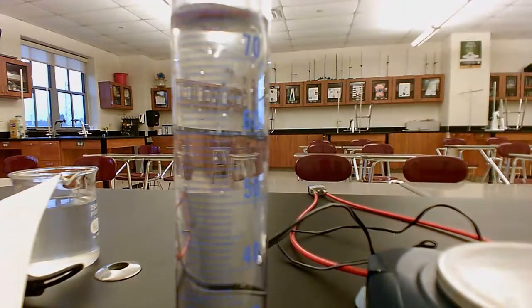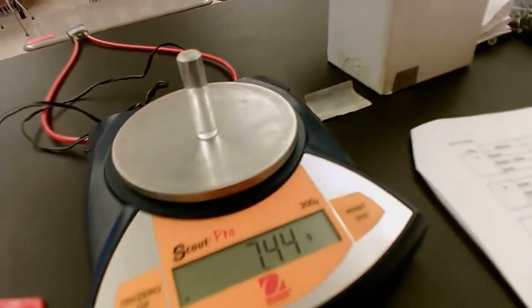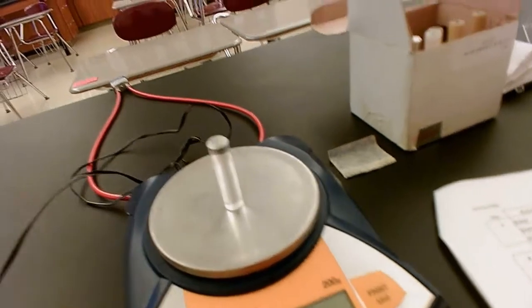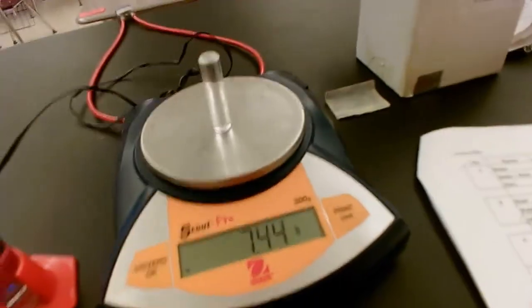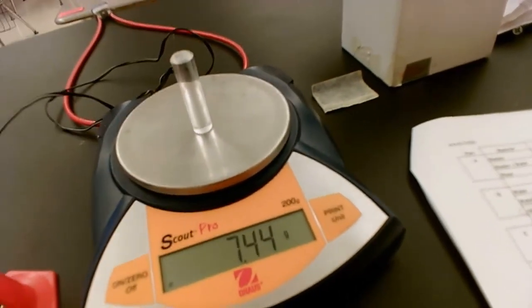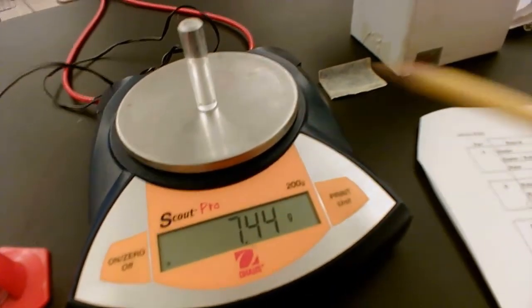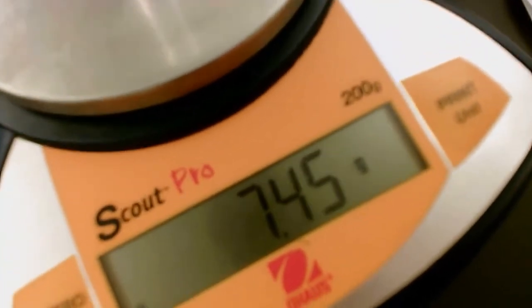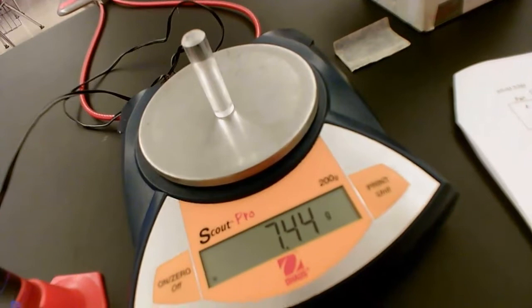All right, so now we are going to do E. Some of you will be E. This is E. Get the mass of E, and the decimal point is right there. This is E, part C, solid E. Record that in your data table.